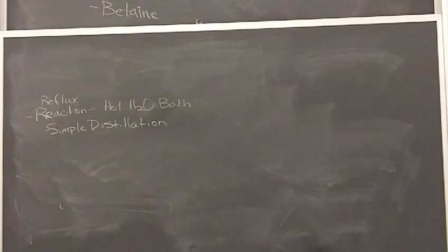Now the reason we are not doing that at this step is we have four rotary evaporators, and methanol takes a little bit to take off, and you already have it good and hot. So it actually is faster for you to do the simple distillation, okay? Then cool everything down, stand in line, wait to be able to use the rotary evaporator, all right? So we're gonna have you do this simple distillation.